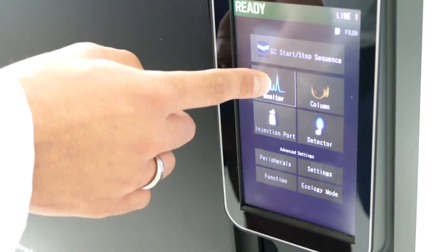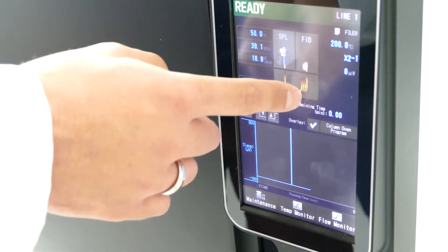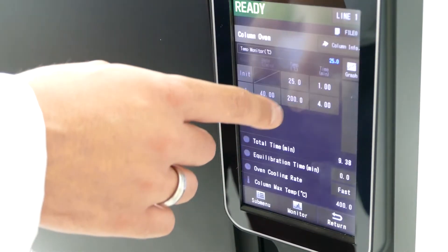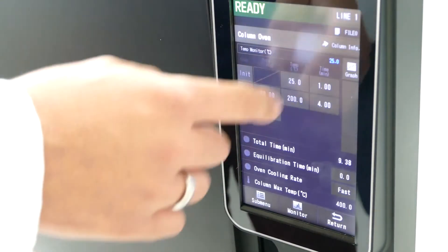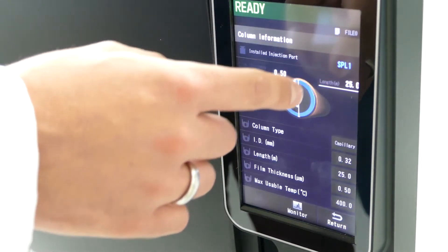The graphical icons make navigation through the menus very easy, and all of the important information can be read out or changed very quickly.